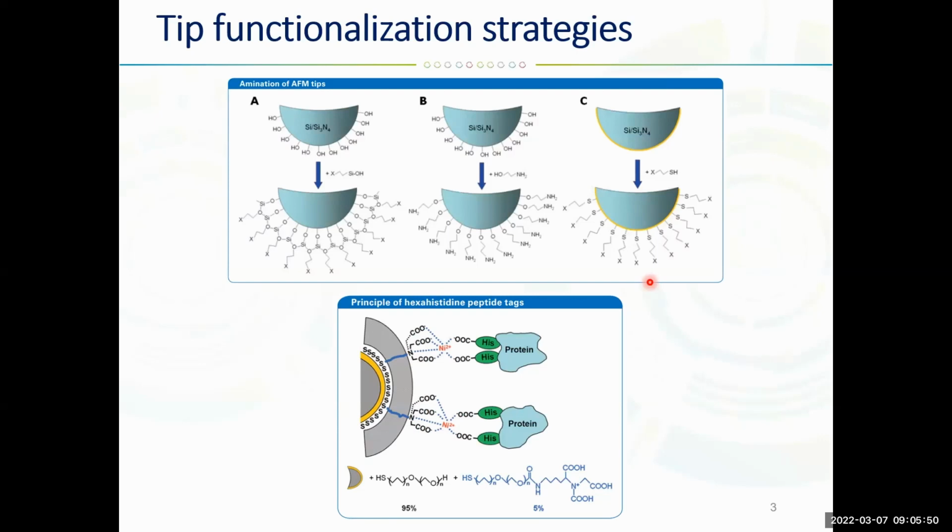Very often we might want to use different linkers. Examples of these linkers are shown on these slides. For example, if we use a protein, the linker can use a His tag. It's usually about 6 to 10 histidine amino acids attached to the tip. It gives a certain level of freedom to our modified probe, because it has some distance from the tip.